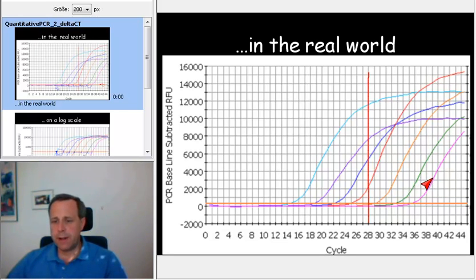whereas the purple sample down here contained only low amounts of template so we get detectable PCR products only quite late, took about 40 PCR cycles, that's quite a bit to amplify that sample.